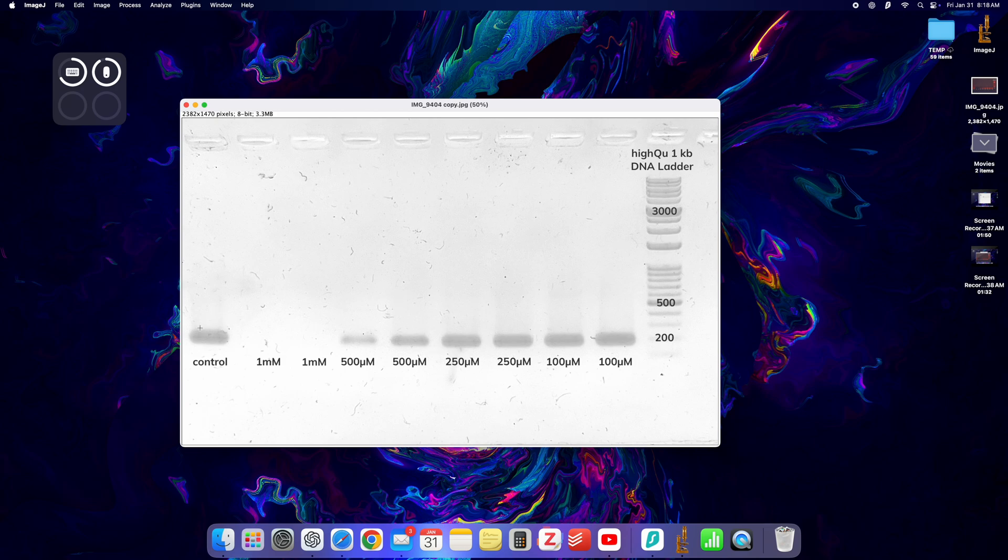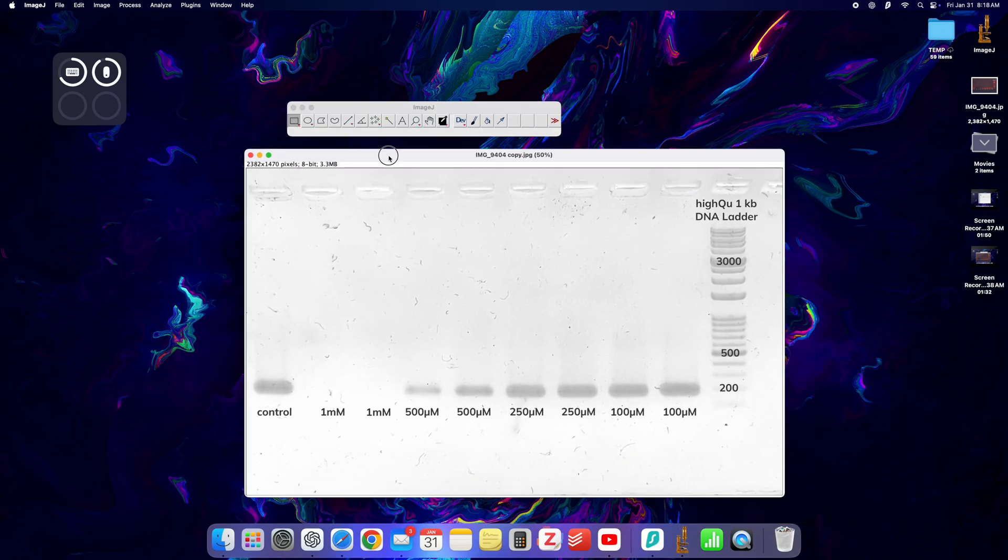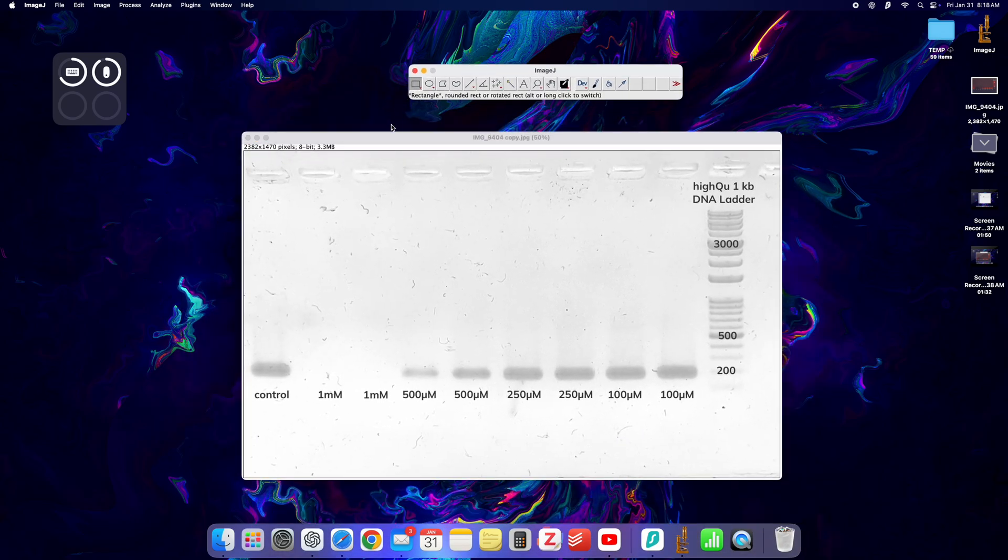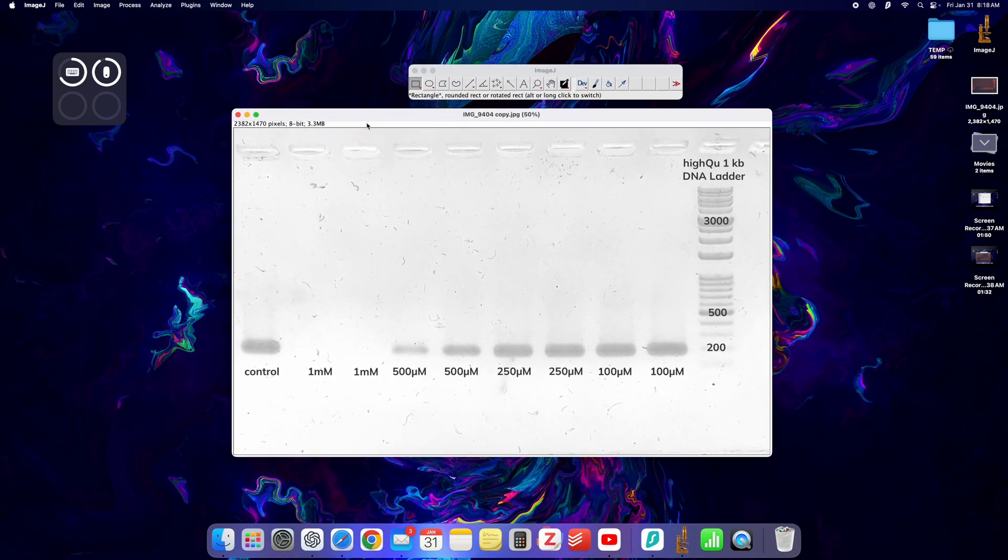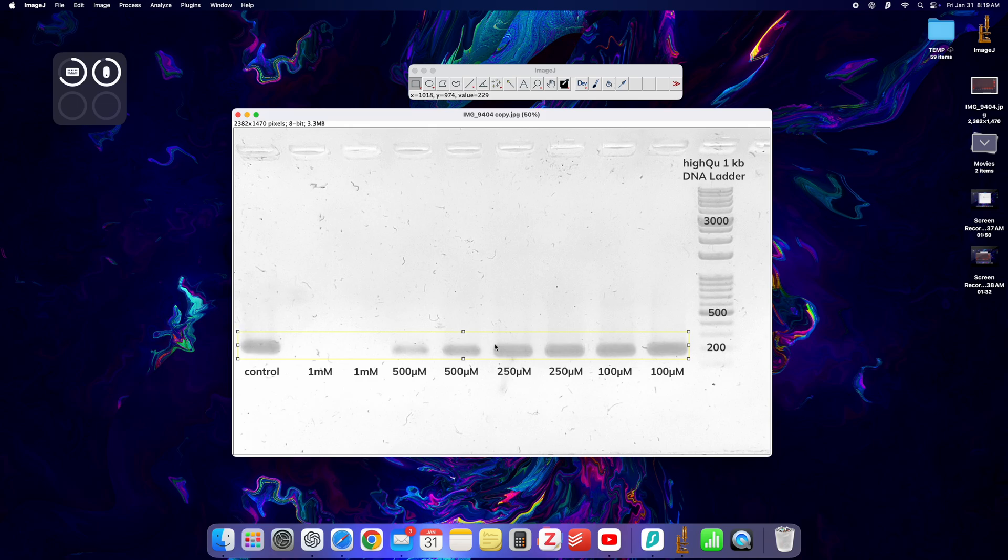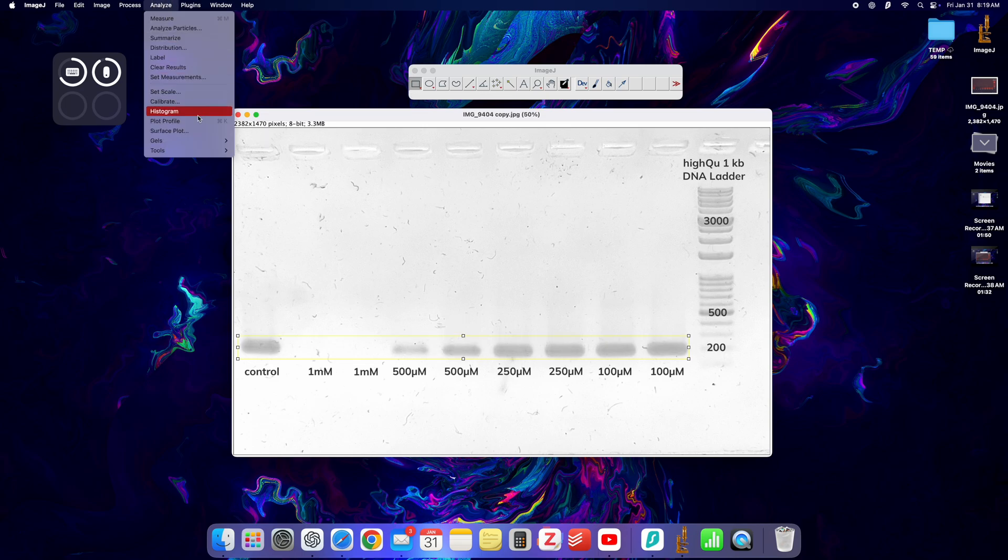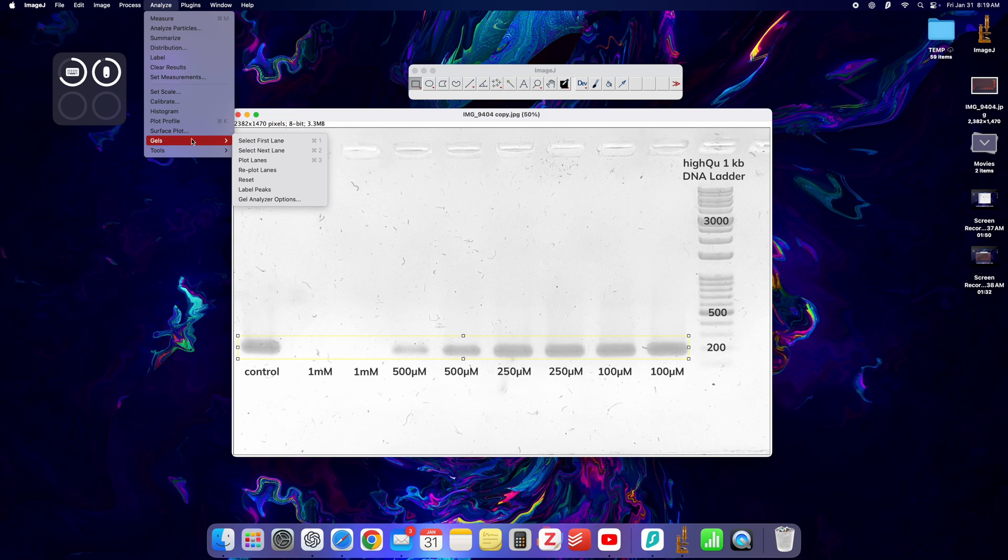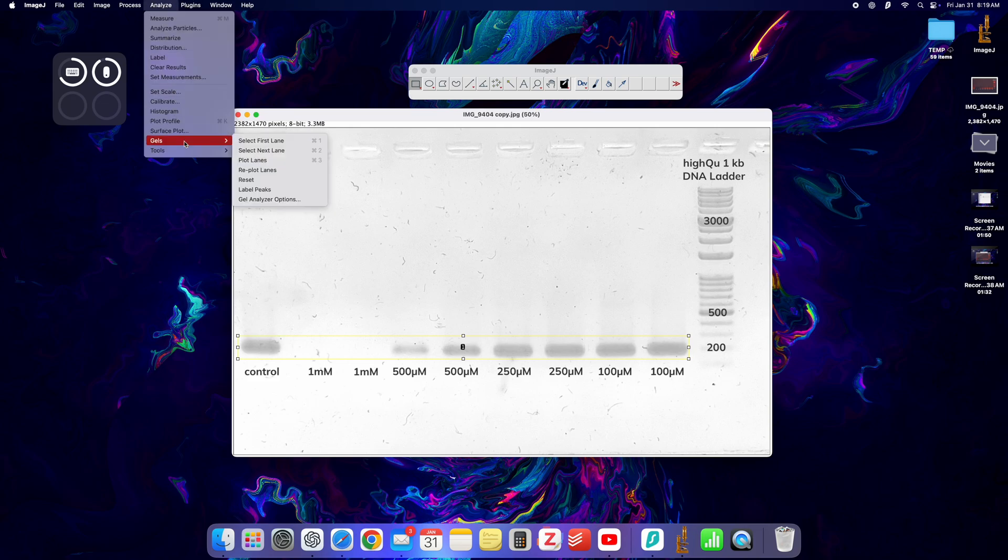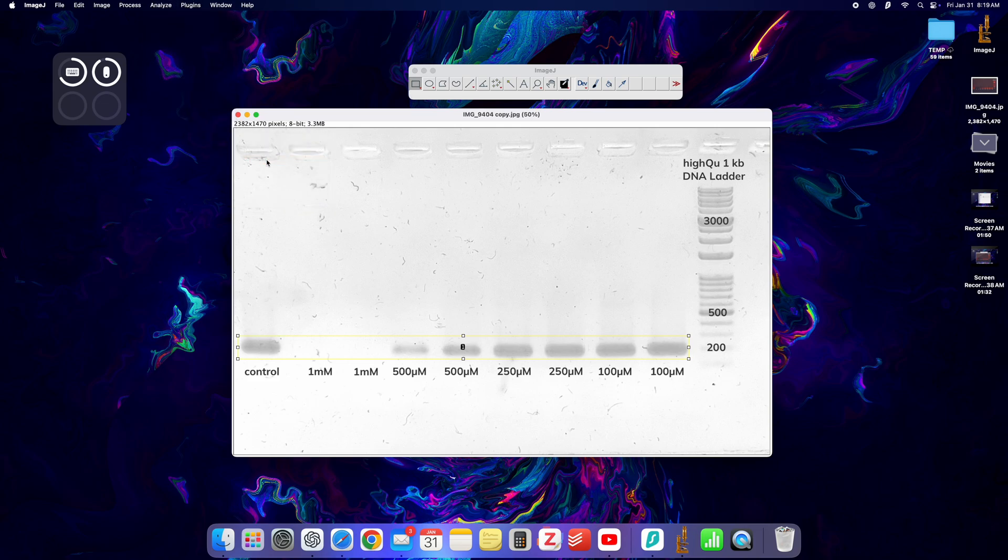Okay, so now we have the image processed in this way. What I would basically need to do right now is select the rectangle tool from here and encompass all of my lanes of interest right here. This image should be as straight horizontally as possible. Now I'm going to go to analyze gels select first lane, after that analyze gel plot lanes.